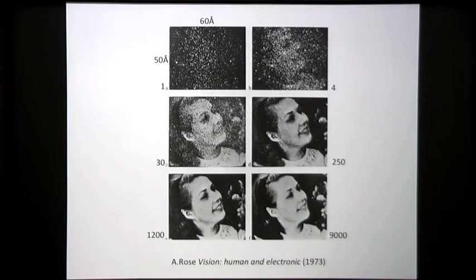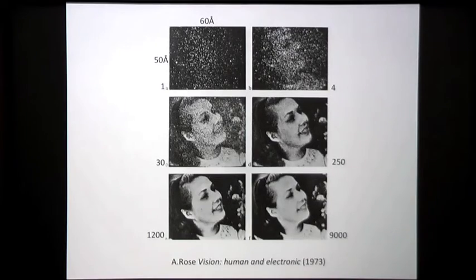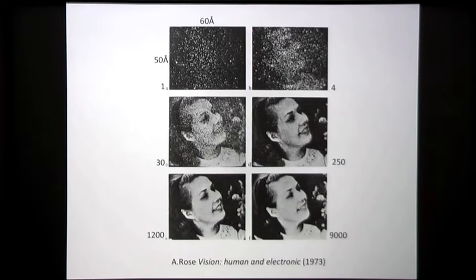And this is just by way of a pseudo illustration of what goes wrong or what goes right. This is photon limited light imaging, but the principle is the same as it would be for electrons. It's a bit arbitrary, but I just think it demonstrates the point quite nicely about noisy imaging. I've arbitrarily said that this is 50 by 60 angstroms because this image, where this was taken from, this book by Rose, had 3,000 photons in this area. So that, in this kind of very arbitrary scaling, is equivalent to 1 electron per square angstrom in this context. It's a bit phony, but it gives you a relative scale.